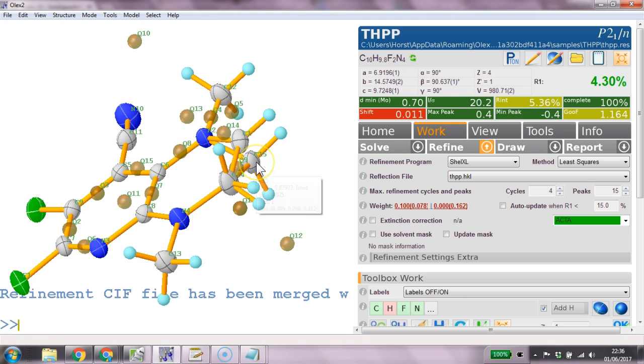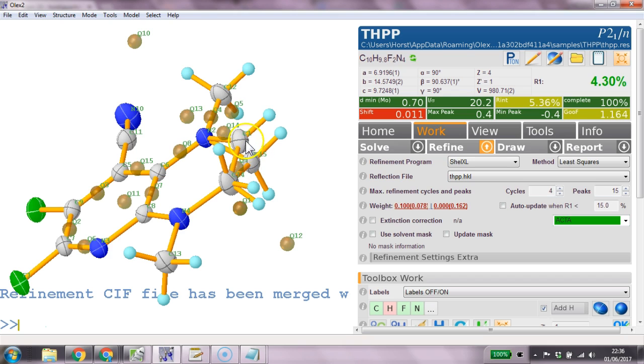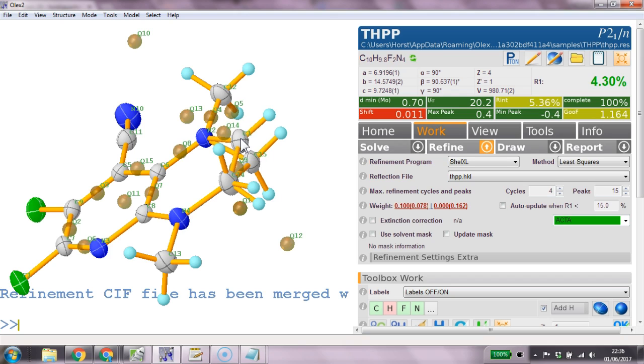And we are ending up with the not fixed occupancies. That's right. Fixed. What have I done? What have I put in there? Fixed it. Fixed it at 0.12. What happened? Fix. OQ. 0.12.